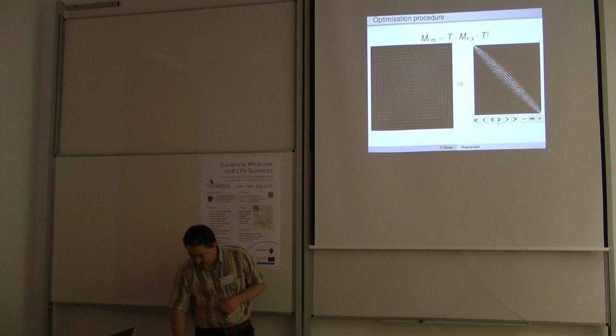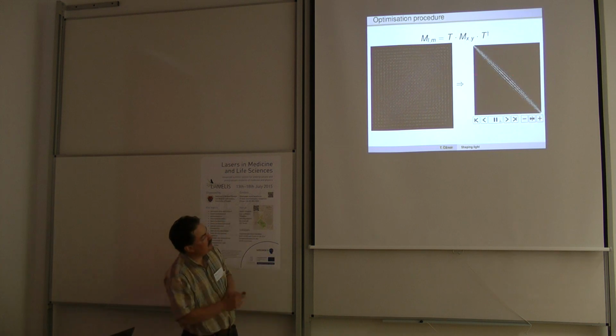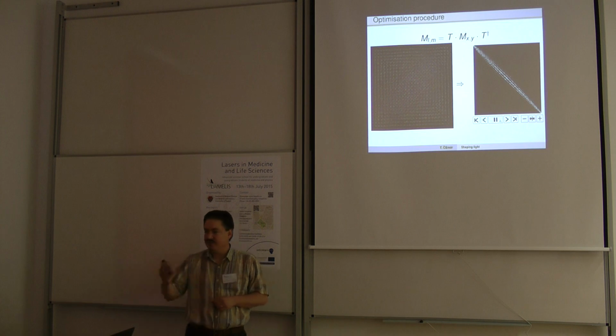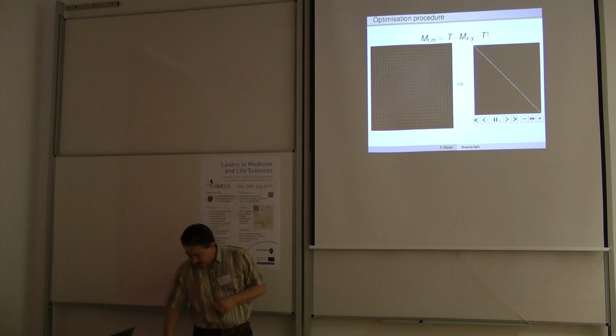So I developed an optimization procedure, a quite fast computation that takes about 2 hours to converge. It tries to implement all these misalignment possibilities, and essentially it finds a match, so you can get these misalignment parameters, the 12 degrees of freedom, and get a very nice transformation matrix. So I will skip a couple of other slides.